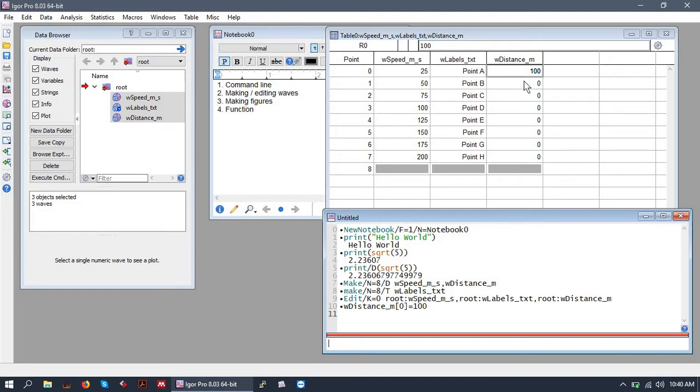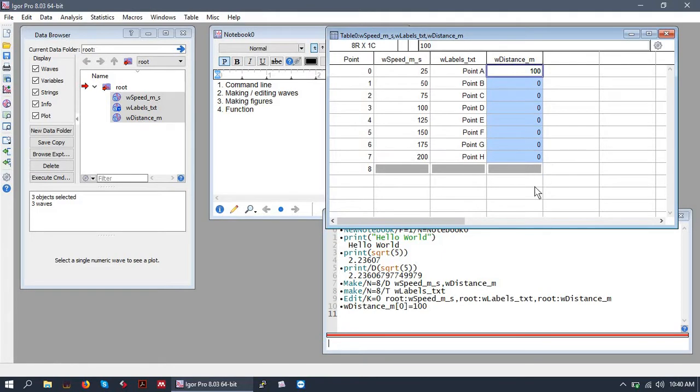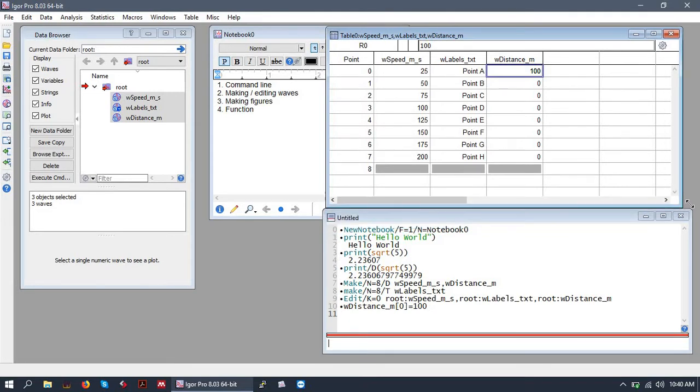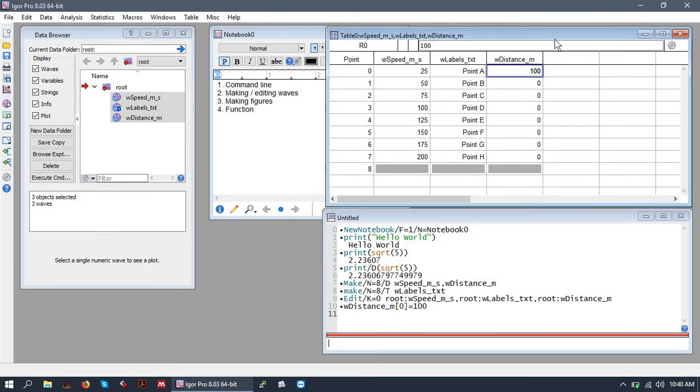One thing to note here is that indexing in Igor like many other programming languages begins at zero. So what that means is this is an eight-point wave but the way it's indexed is from zero to seven. So the last index is seven and the first index is zero. This seems confusing at first to people who are not familiar with programming but it is very standard and you will get used to it very quickly.